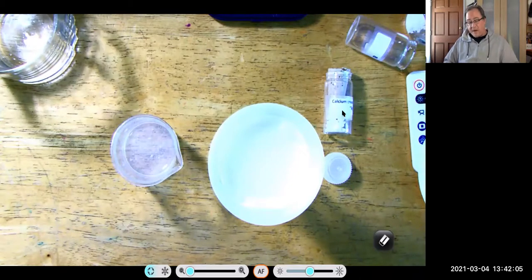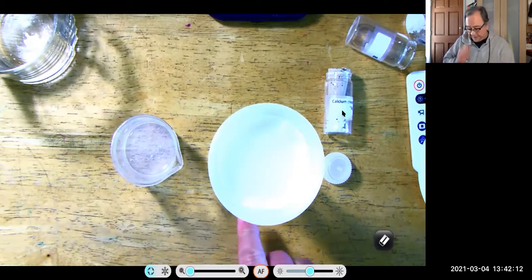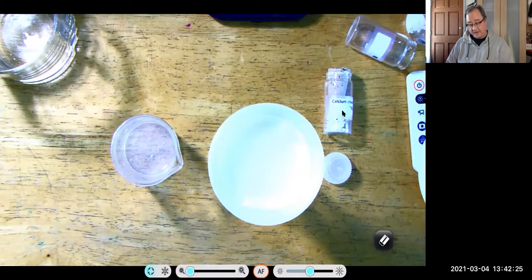Now I'm looking at the bottom of my funnel, the little cylinder coming out of the bottom of the funnel, and I notice that there's about a drop happening right now, about every 10 seconds. Oh, now it's gotten faster. It's like a drop every second.